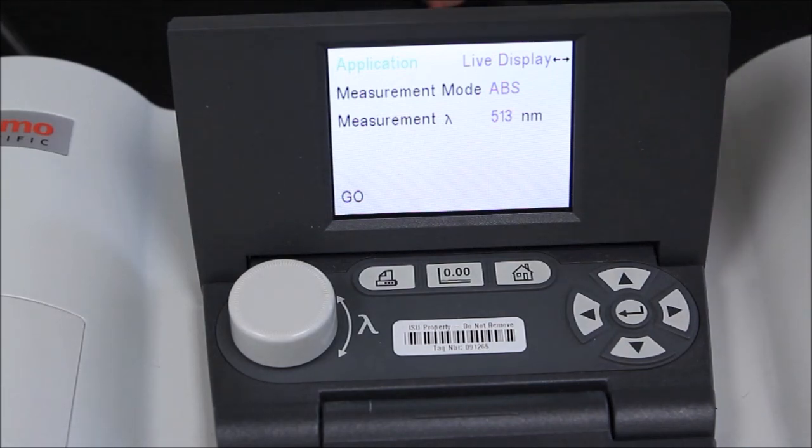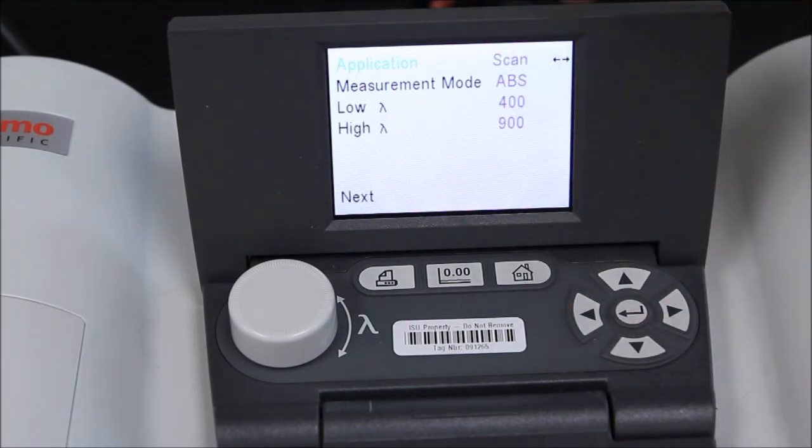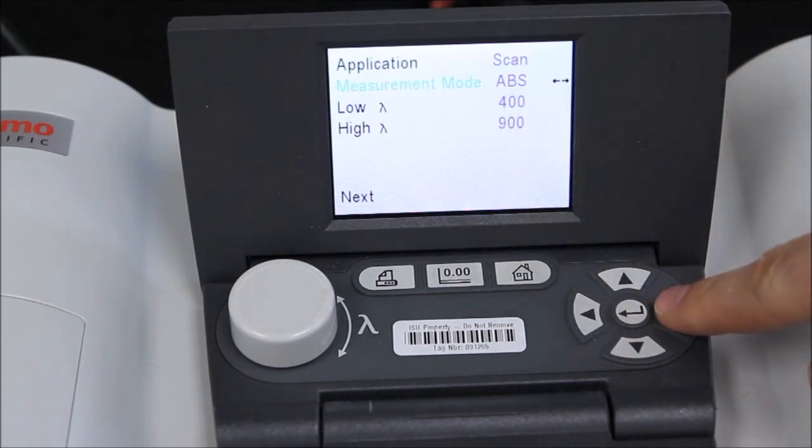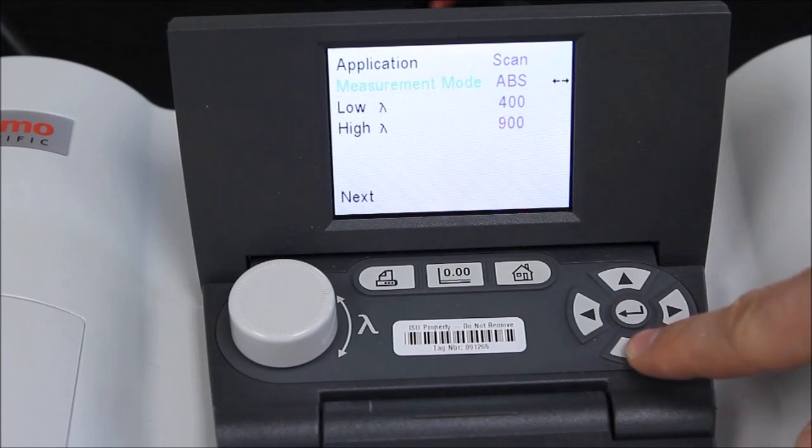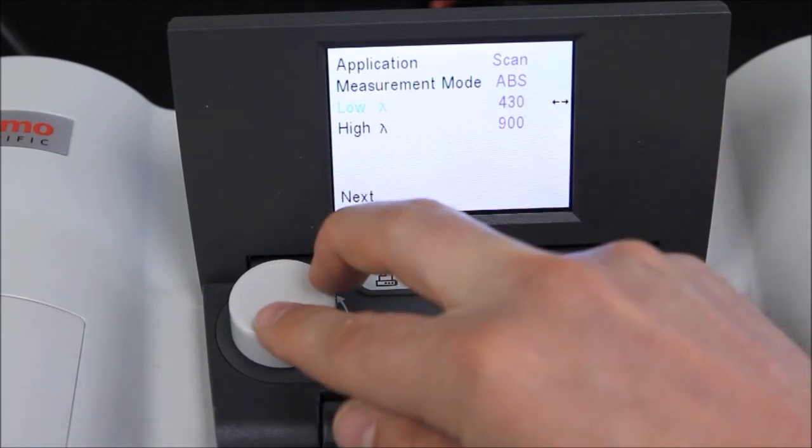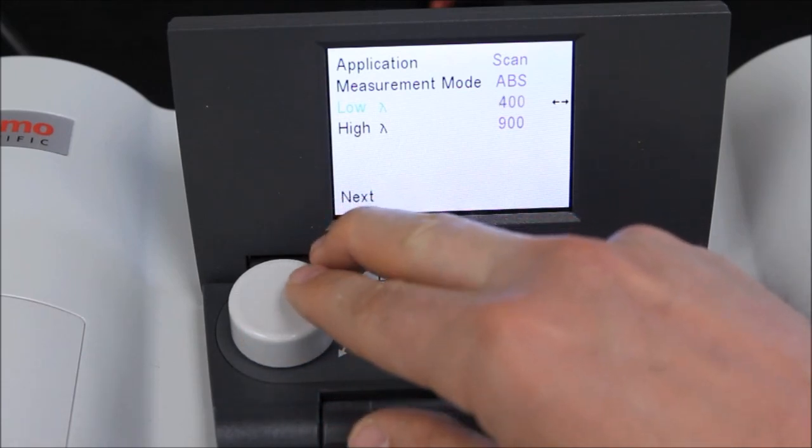If we don't know the optimal wavelength for our experiment, we should start with the Scan application, where we have the option between absorbance and percent transmittance output, as well as defining the low and high end of our wavelength scan. By turning the knob clockwise or counterclockwise, we can increase or decrease the wavelength in 10 nanometer increments.